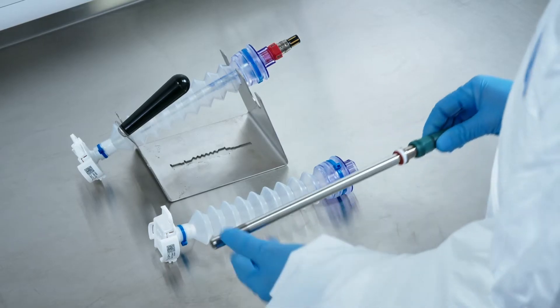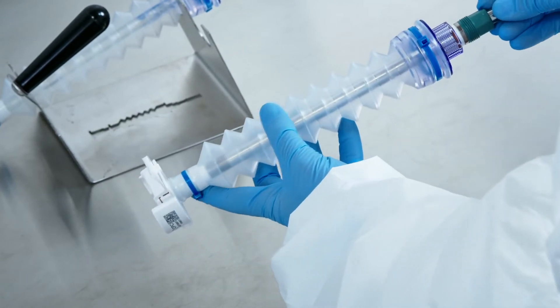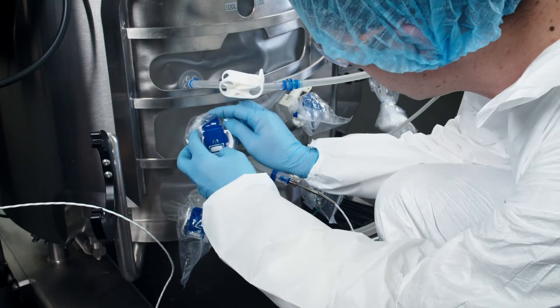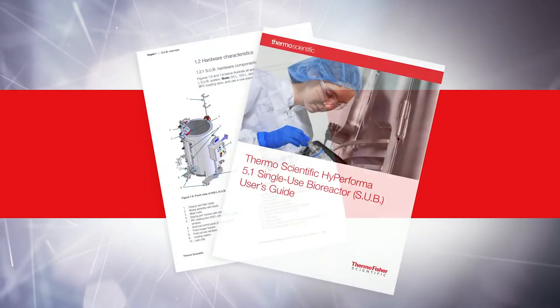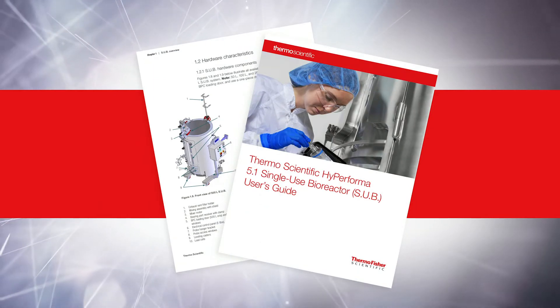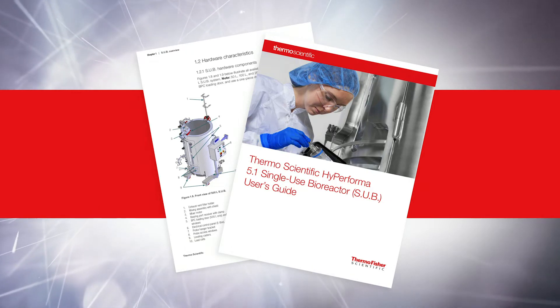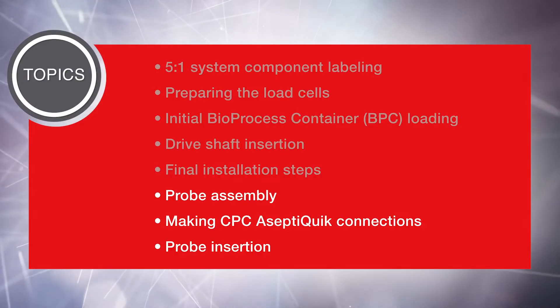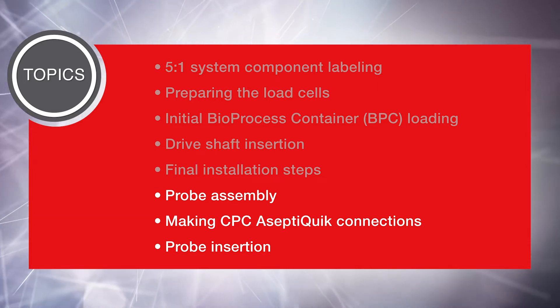This video is part three of three videos that cover setup and installation topics related to the Hyperforma 5-to-1 single-use bioreactor or SUB. It is based on the Thermo Scientific Hyperforma 5-to-1 SUB user's guide. Please refer to the user's guide for detailed instructions. Topics covered are also applicable to Thermo Scientific Hyperforma 2-to-1 SUBs, unless otherwise noted. In this video we will cover the following topics: probe assembly, making CPC aseptic quick connections, and probe insertion.